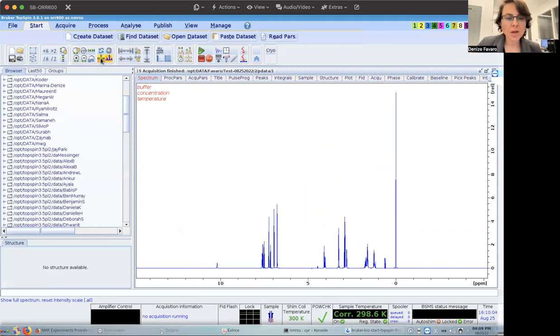So what happens is I'm going to end this video and start a new one with different pulse sequences for water suppression. I think it's going to be more useful, rather than having a really long video.